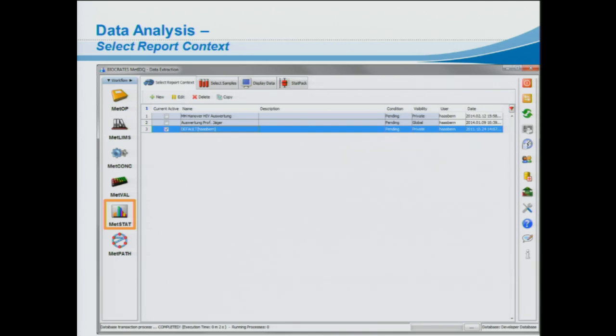And you can also share this report. First it's private, and then you can set it global, and everyone who is connected to the database can see it later. So that's the idea here. And you can copy one. All right, awesome, thanks. You're welcome. Sounds great.